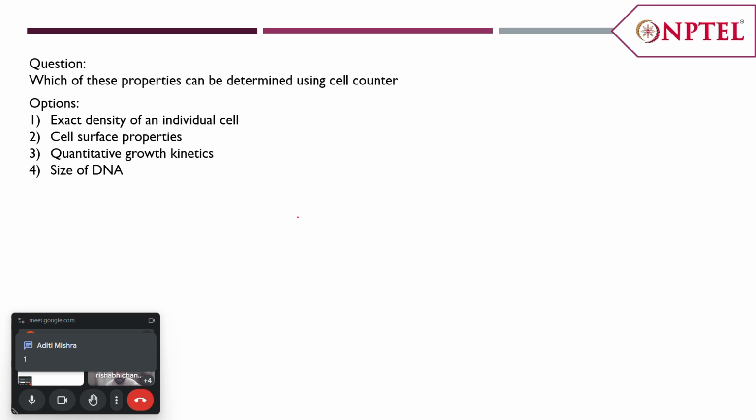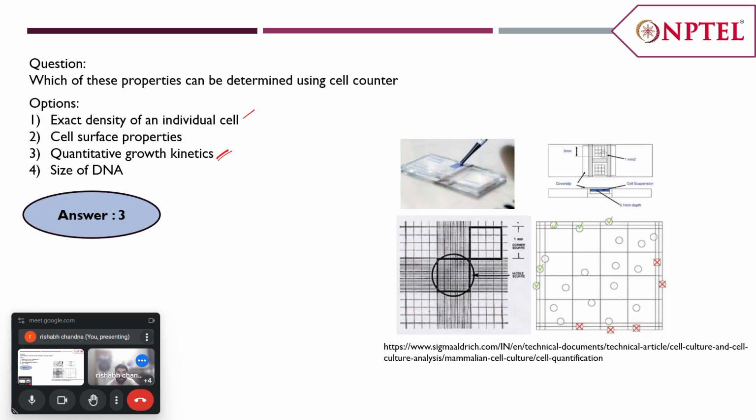Okay, any more answers? Okay, so basically, the correct answer is option number 3. And here is a typical cell counter that is used in a laboratory.